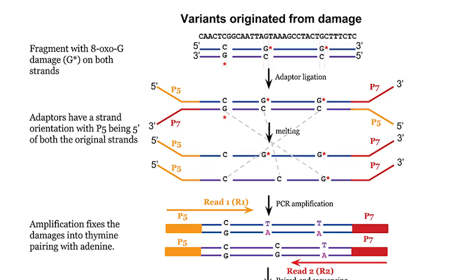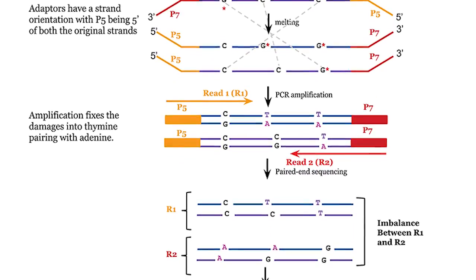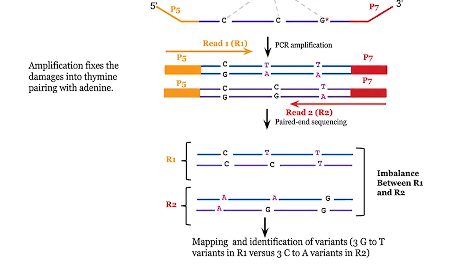Not all damage leads to sequencing errors. Some lead to a loss of signal, while others are more insidious, causing a polymerase to read the damaged base differently than the undamaged base. Guanine bases are known to react with oxygen, forming 8-oxoguanine, which is read by many polymerases as a T instead of a G. This is insidious because, unlike strand breaks, where no information is generated, you instead get incorrect data, which can look like a rare somatic variant.